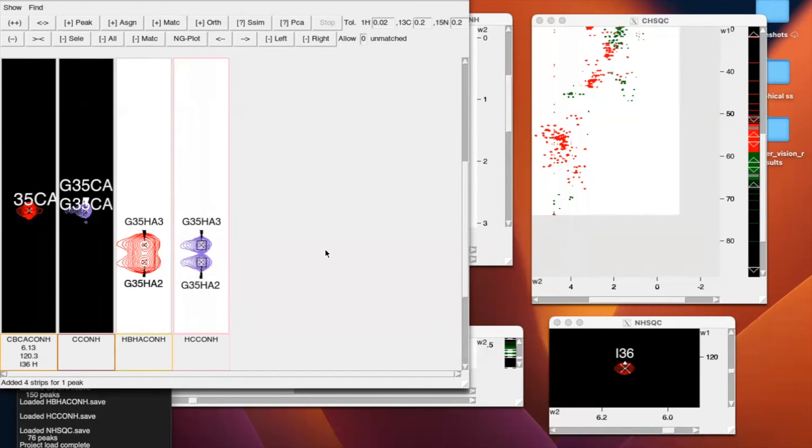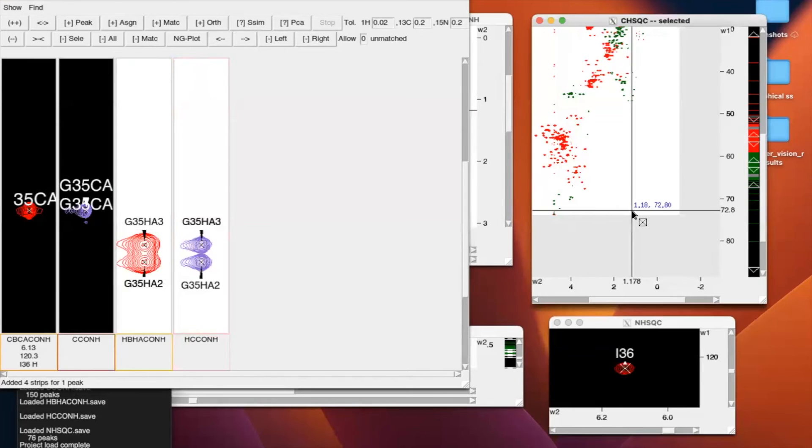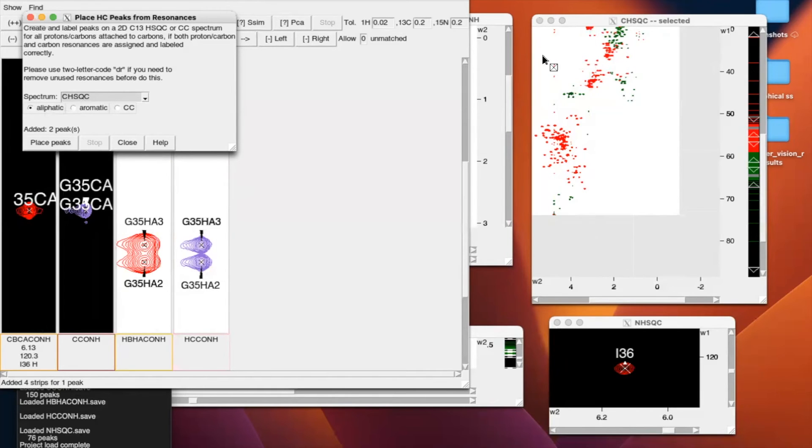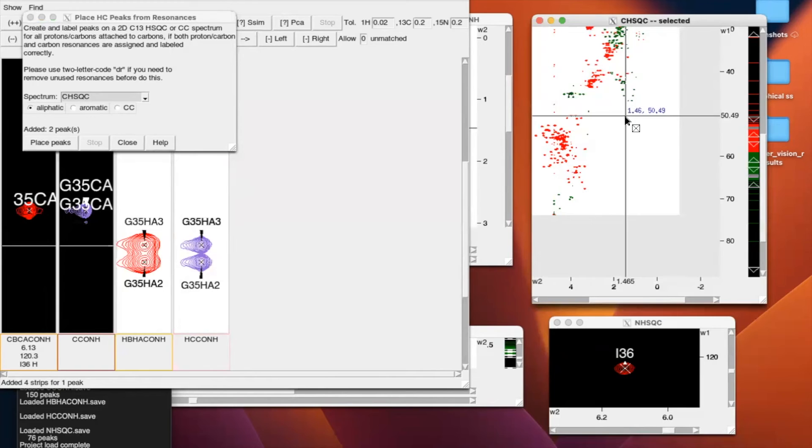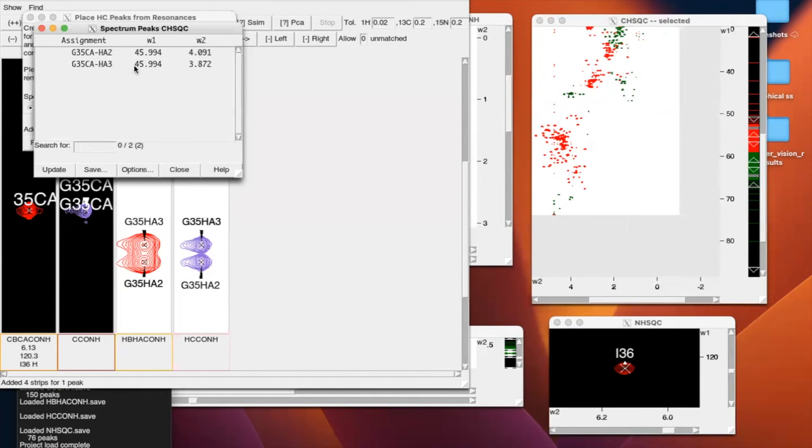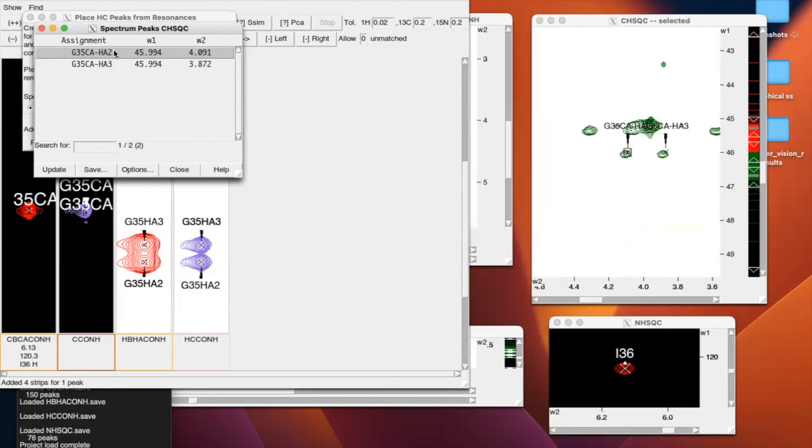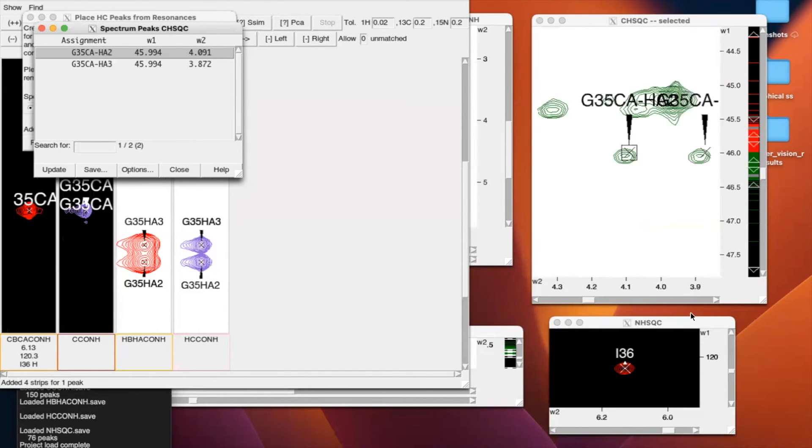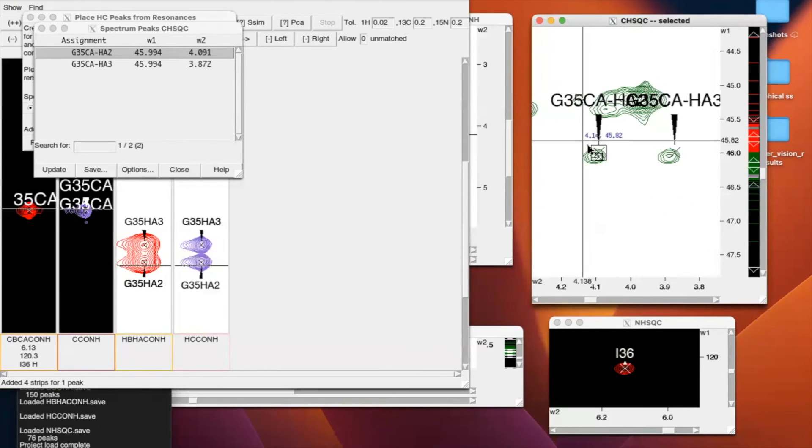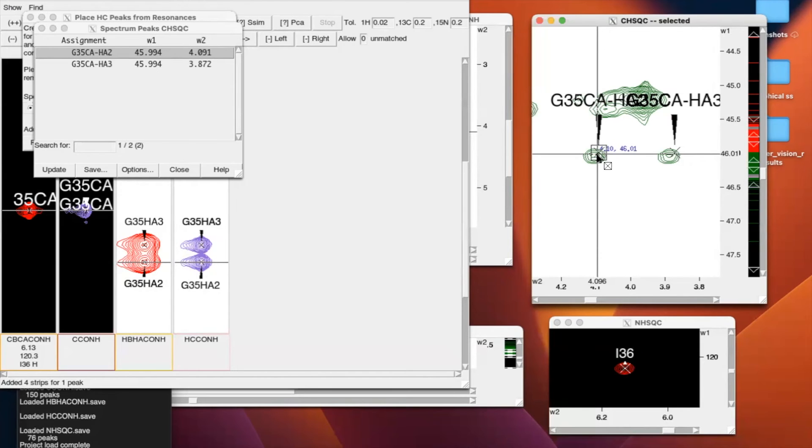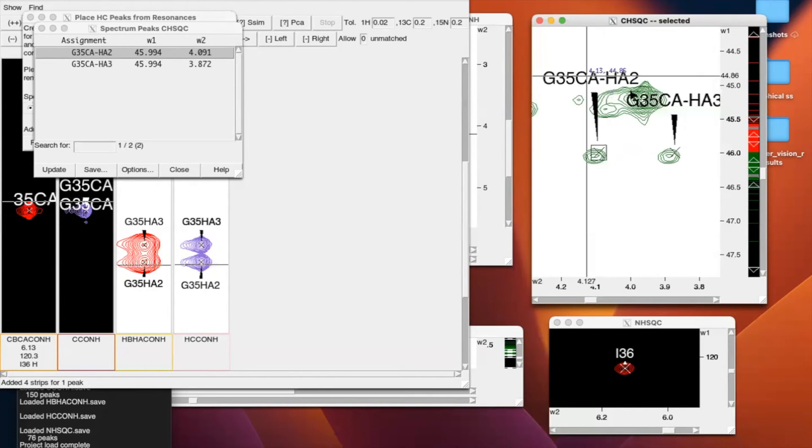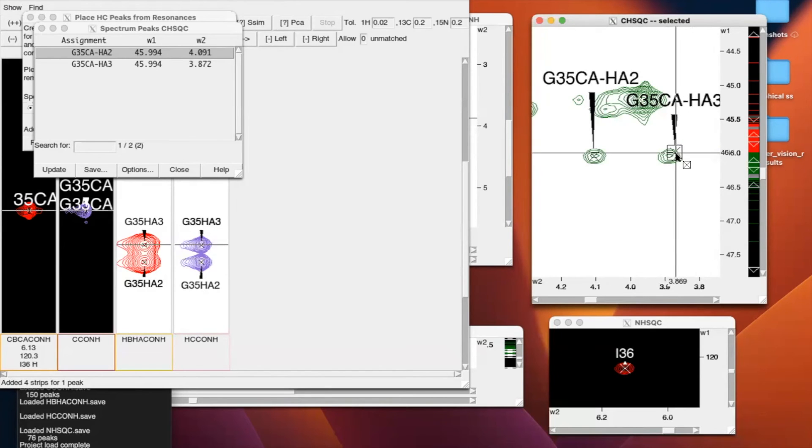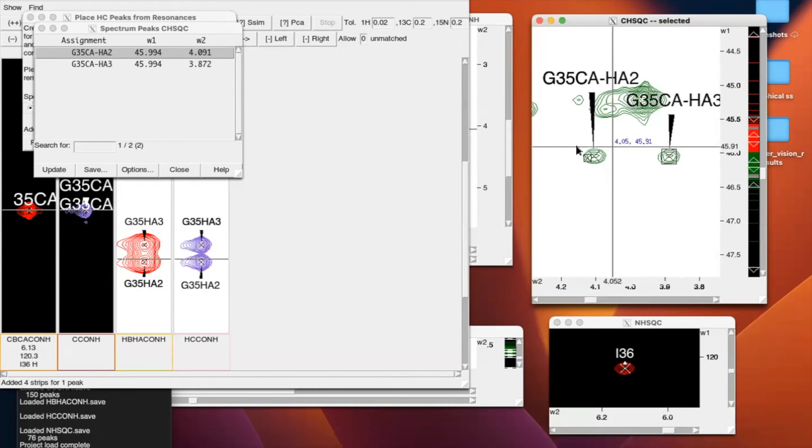Next, we want to find the peaks in C-H-S-Q-C. And to do that, we're going to enter the two-letter code H-C. We're going to make sure our spectrum is the C-H-S-Q-C, the aliphatic, and just place those peaks. And here, we can go to the C-H-S-Q-C, L-P-T, and see that they have been created. See that these two peaks are at the same carbon chemical shift, which makes sense because the protons are attached to the same carbon. So in this case, they aren't simulated. They're real assignments, so we can just center it with the two-letter code PC for peak center. And then the sidechain for residue 35 is complete.